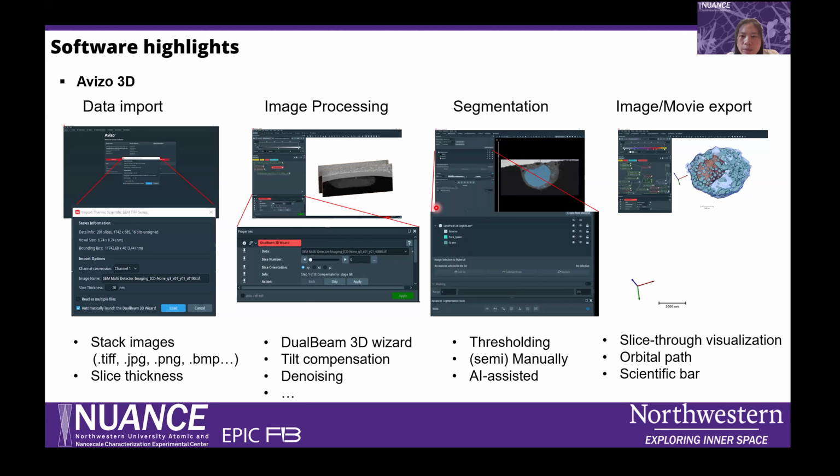Then you can do the segmentation, and here you have many tools to segment and color the different phases, like automatic thresholding, markers, and AI-assisted tools.